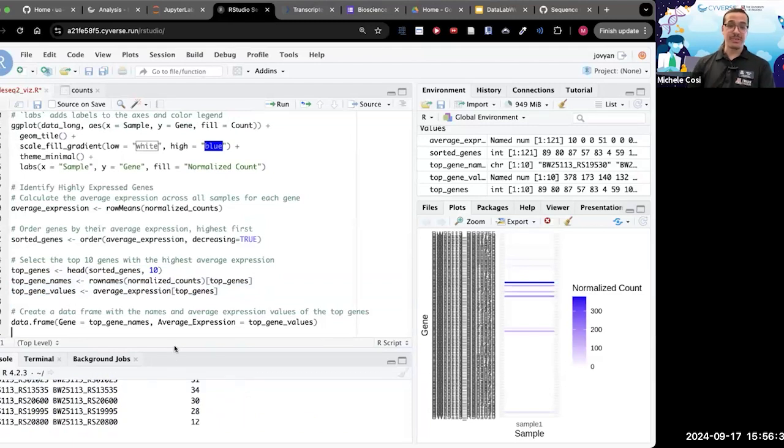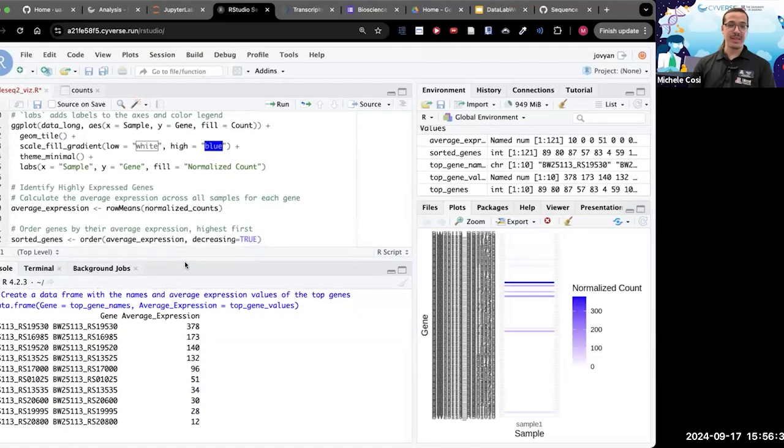So ultimately, I'm sorry I'm rushing ahead. I'm just a little bit out of time, but the R file is right there, and therefore you should be able to reproduce this in your own time with some annotations. Yay, the average expression of a specific gene is higher than the others. Is this the gene of interest for you? Well, maybe. Who knows?